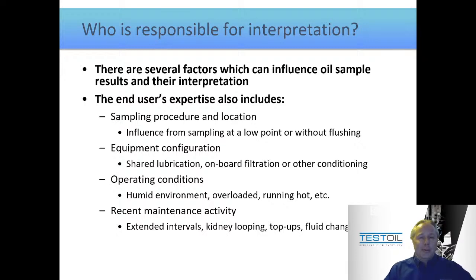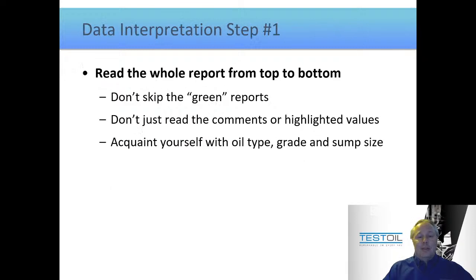So what I'd like to show you now is the 3 basic steps to get through any oil analysis report, like I said, quickly and efficiently so that you can come up with an actionable item. So step 1 sounds very easy, but I assure you it takes a little bit more patience than you might think. Read the whole report. And by the whole report, I don't just mean all the data the lab has provided you. I actually mean read the parts of the report that the end user provided some data for and assess the whole picture, right? Don't interpret as we go, all those kinds of mistakes I pointed out. We're going to read the whole report.